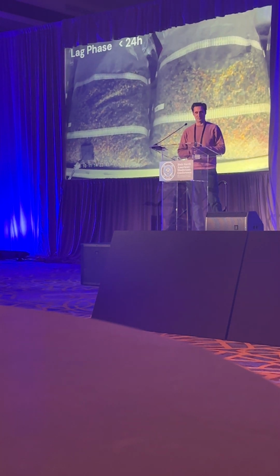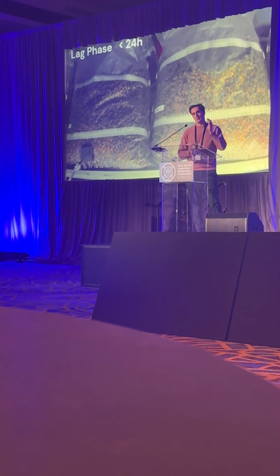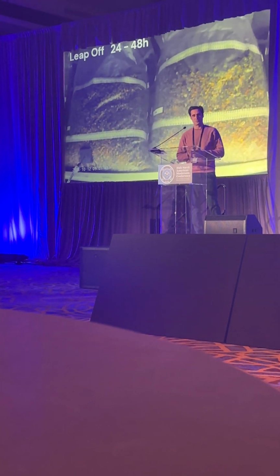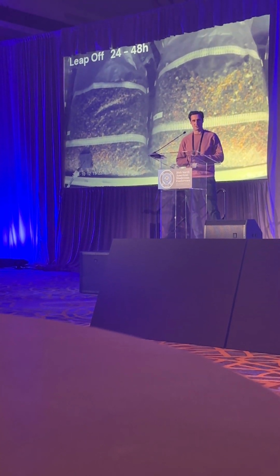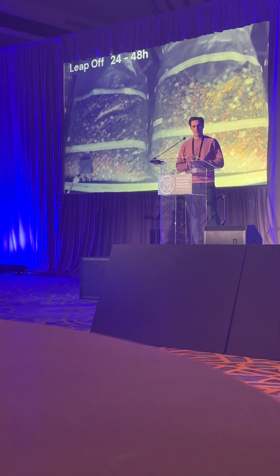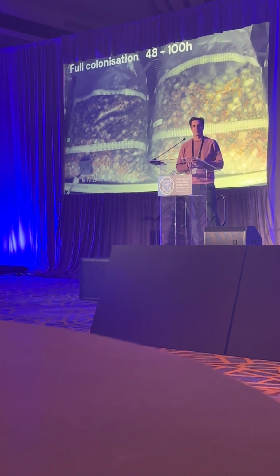Okay, so we have made a small time lapse of the growth. So again, the lag phase, there is no visible growth. Then leap off phase, 24 to 48 hours, you can see that the colonies start to become more white, they start to increase in size. Please bear in mind that these are averages taken over multiple tests. So they're a little bit off, but it proves the point.